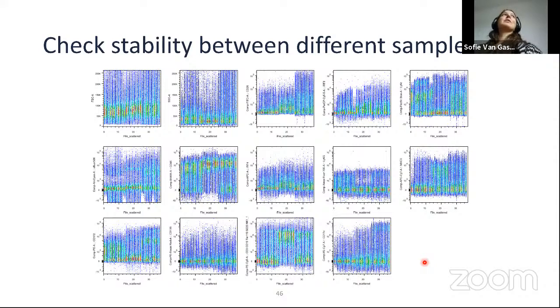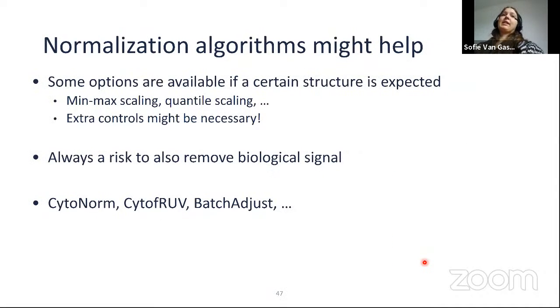Going through different centers might cause a batch effect, all these kinds of things. Also very important is to think about it in your experiment design. If you are working with 2 groups of samples, don't measure all of one type one day and then all of the other type 3 days later, because then you have no way of knowing: is this a technical difference or the actual biological difference of interest? So try to make a good experiment design that mixes your samples as much as possible over the different batches that you will have. And if possible, also take some control examples along.